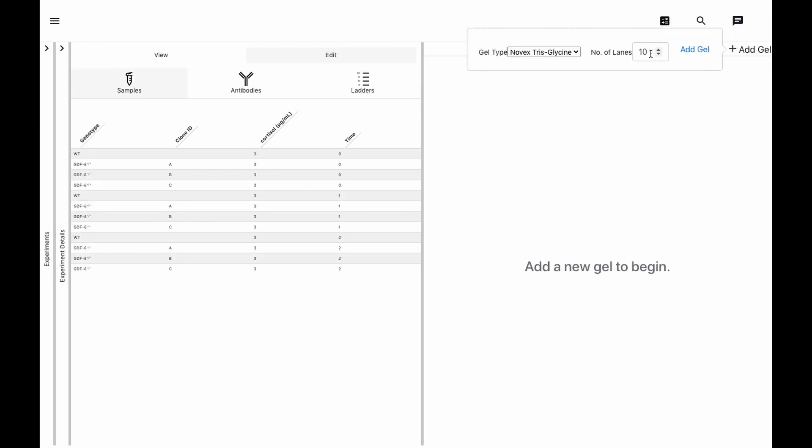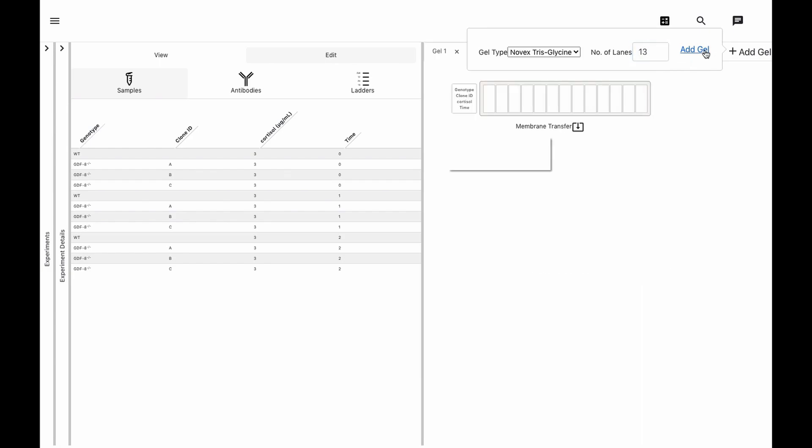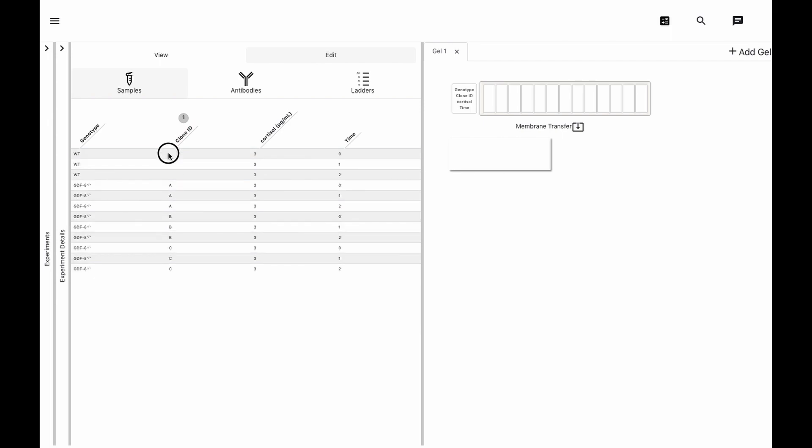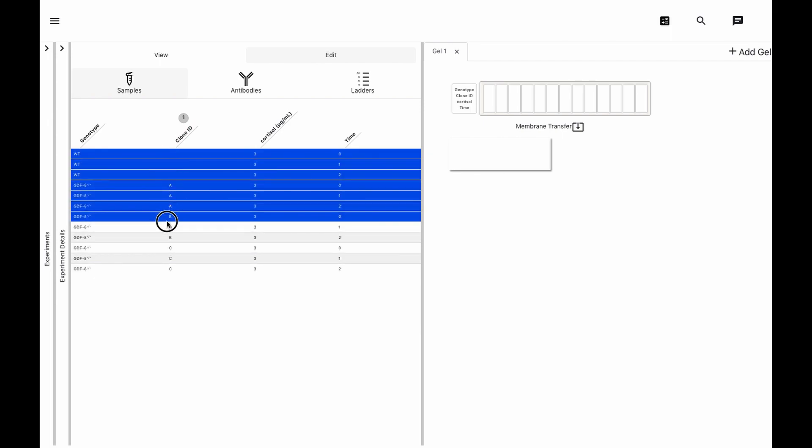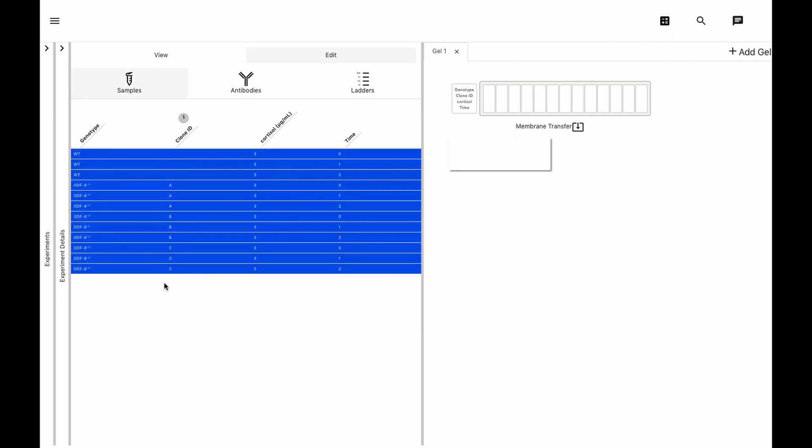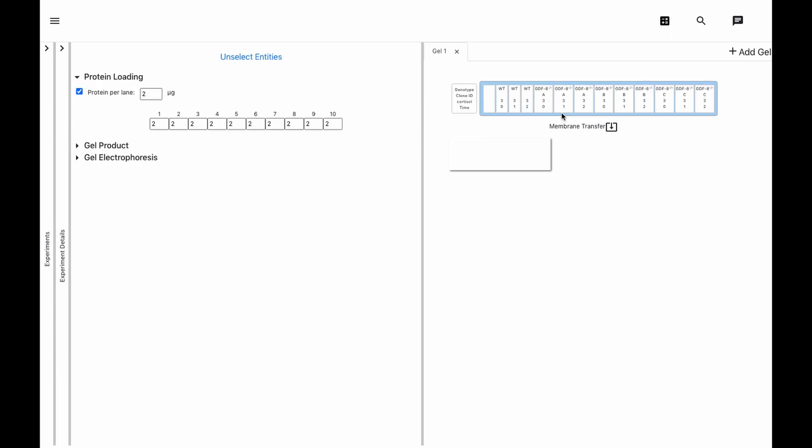We'll create a 13-lane gel and rearrange our samples how we want them in the gel. You can tweak protein loading and gel electrophoresis details simply by clicking on the gel.